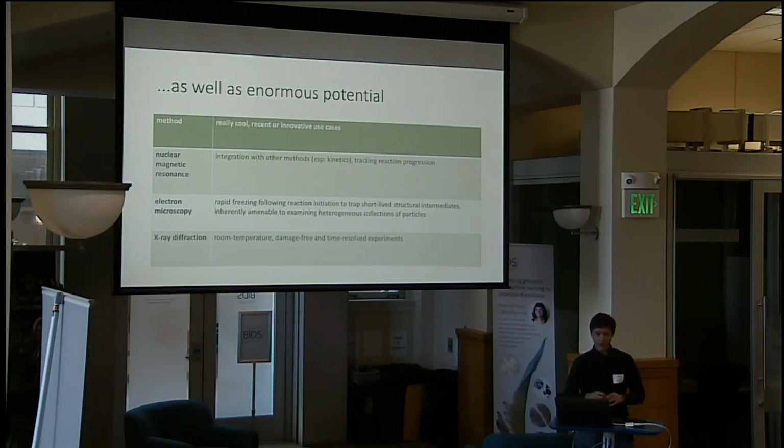With X-ray diffraction, one of the really cool things you can do is a time-resolved experiment or a room temperature experiment that you can't do with microscopy. You do destroy your sample, but with recent techniques like serial crystallography, you can destroy a whole bunch of crystals one after another, but get native state structures from each one.